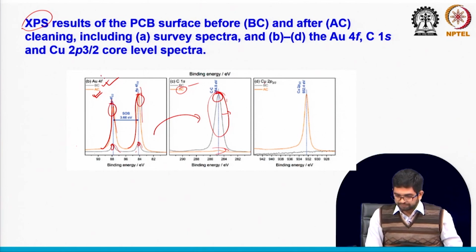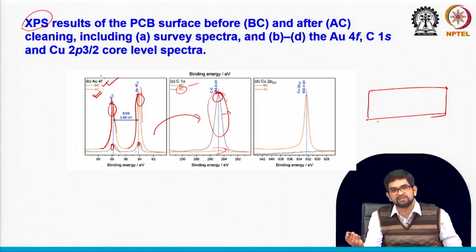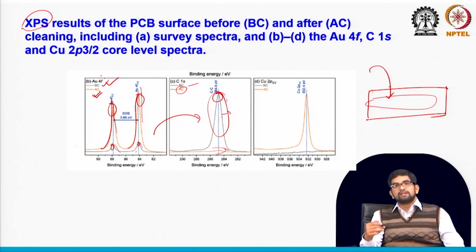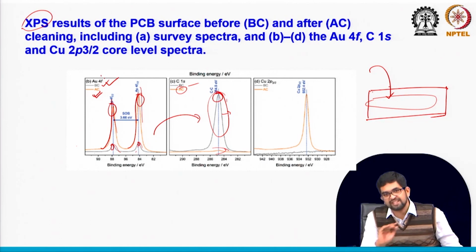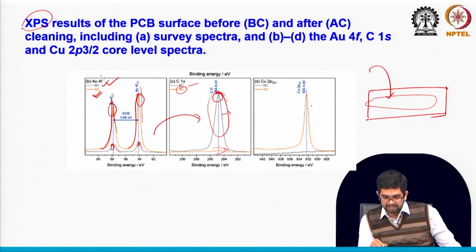See the copper peak. I told you one story last time. When the PCB factory makes the design you send, they use a copper layer below, and then on that copper they use the gold. So if this copper is exposed during the pretreatment process, because we are using a very thin gold layer, only a few nanometers, on top of the copper, it can impact the result. That is why you can see some copper peak here after cleaning.